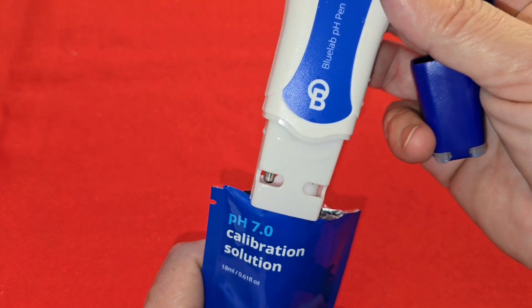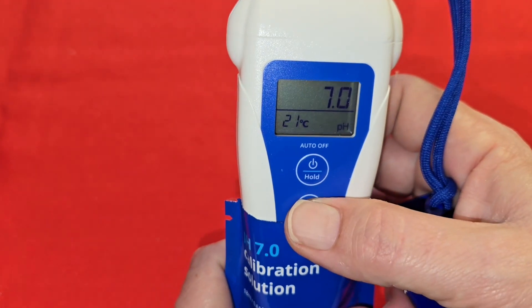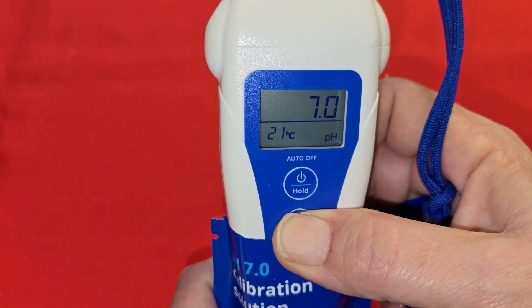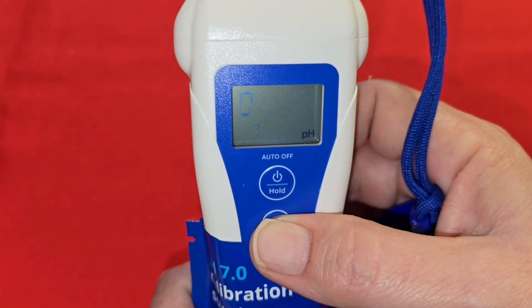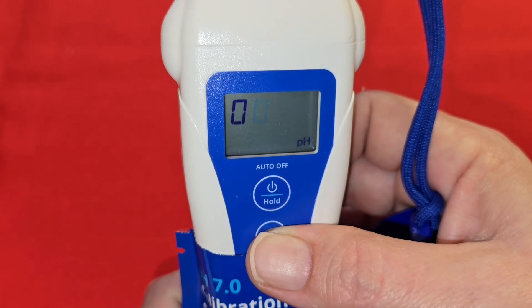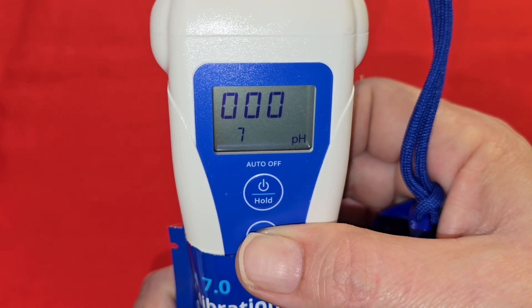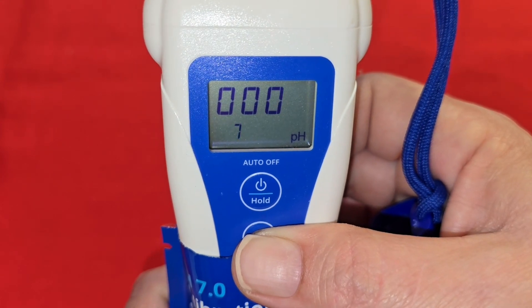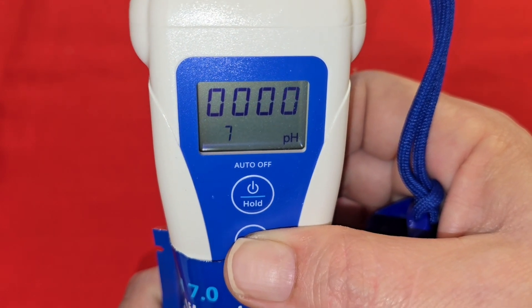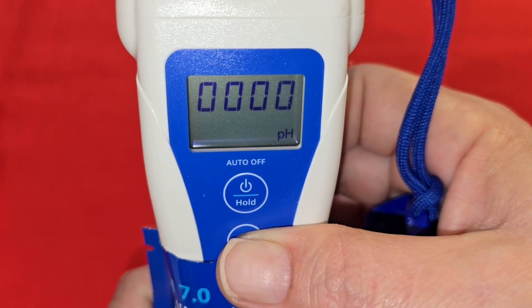Open the satchel and place the probe inside the satchel. Hold down CAL, and you're going to see four zeros pop up on your screen. Now we've been calibrated to 7.